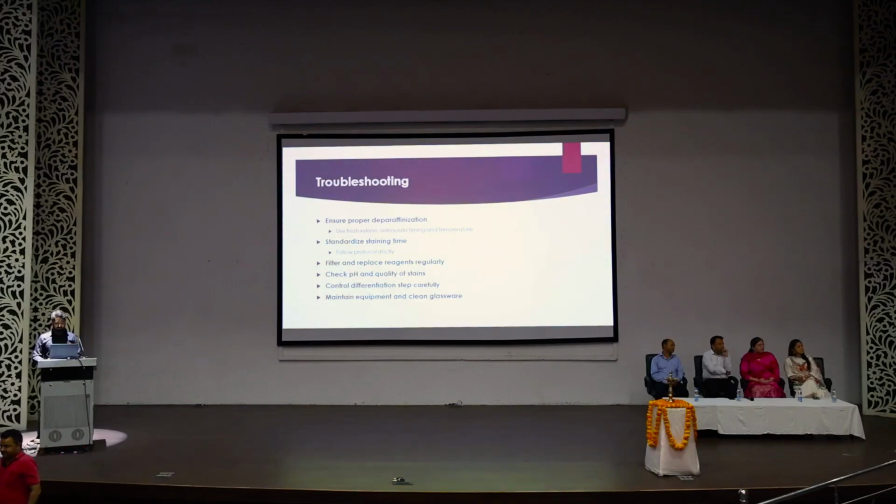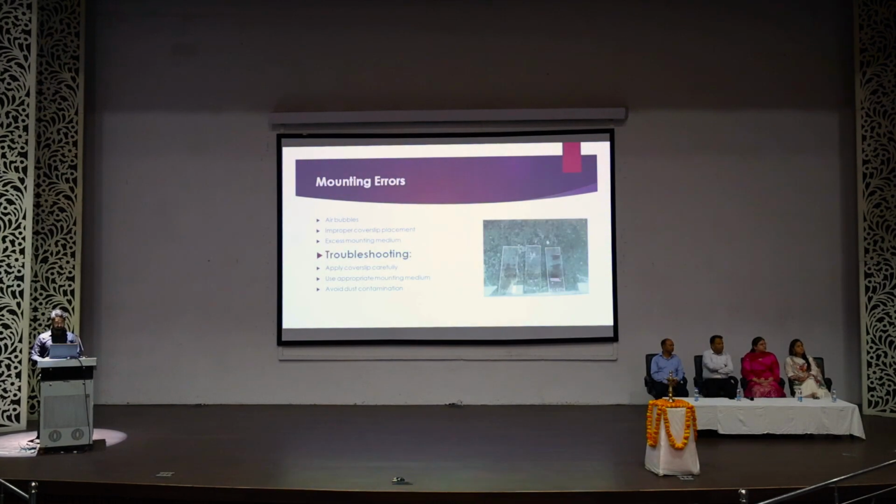Mounting. After the staining is complete, the last step is mounting. Common errors that occur during mounting are air bubble formation, improper cover slip placement, and excessive use of mounting medium. As you can see in this image, it is not clear.